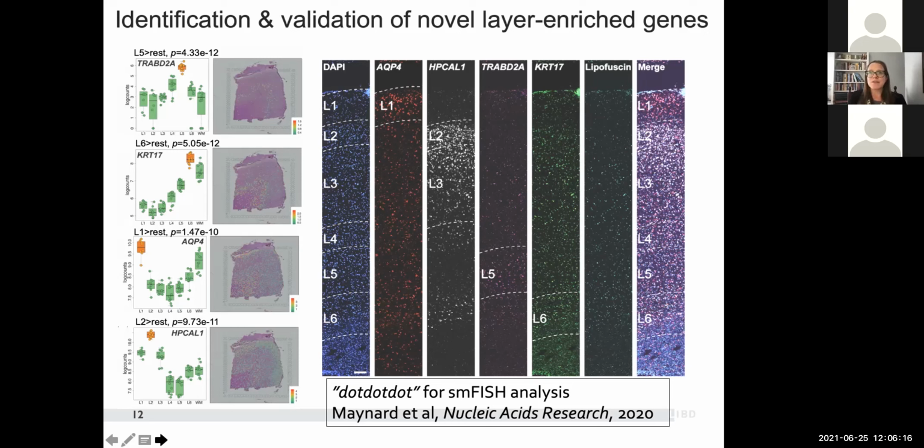And as we've been talking about today, segmentation of nuclei, cell bodies, and individual gene transcripts in complex tissues like the postmortem human brain is really a significant computational challenge on the image analysis side, especially because postmortem human brain has high autofluorescence due to lipofuscin, which is a product of lysosomal digestion that increases with age. So as multiplexing increases, this is an obvious area where computer vision approaches could make strides in the analysis of SM-FISH data, especially highly multiplexed data across large areas of tissue.